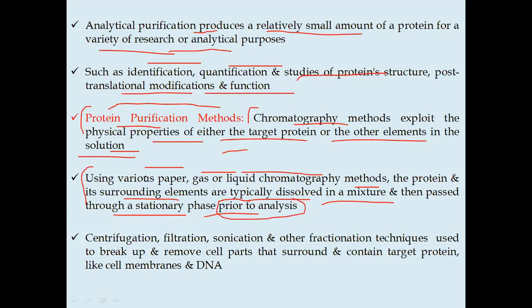So for purification purposes, we use different types of paper, gas, and liquid chromatography methods, and proteins and their surrounding elements are first dissolved in a mixture and then passed through a stationary phase used in the chromatographic techniques before the analysis of protein.